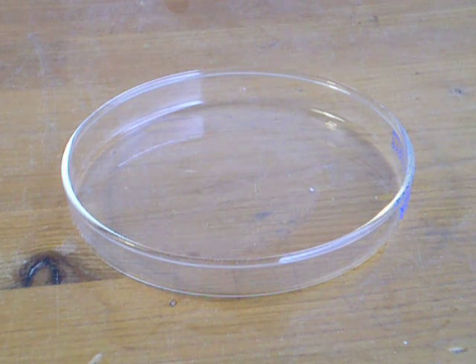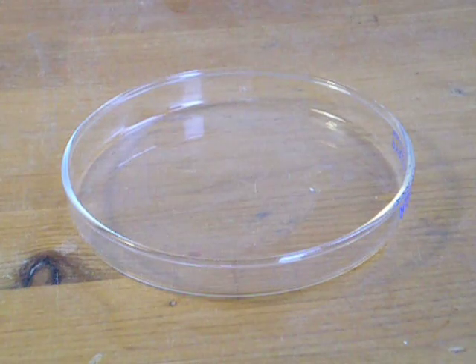Hey, YouTube. Today we're going to be doing an experiment with some ammonium dichromate. We're going to be making a volcano. It may sound like a first grade experiment, but it's actually kind of neat.